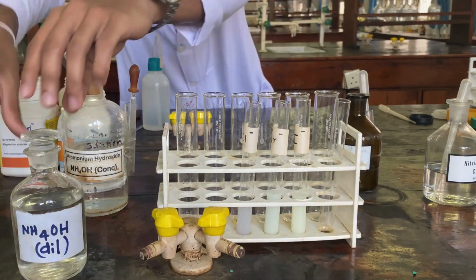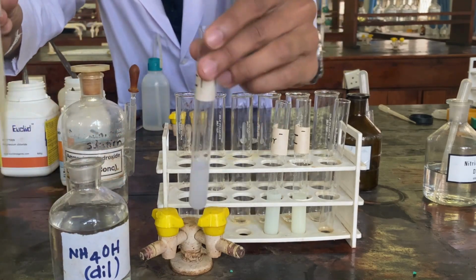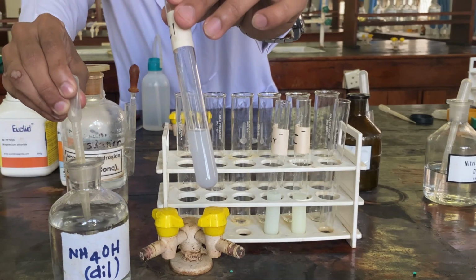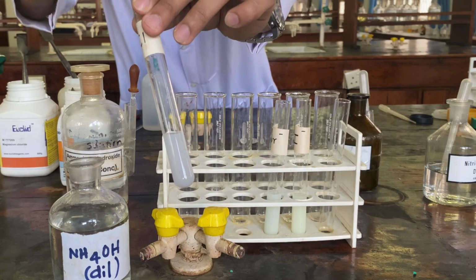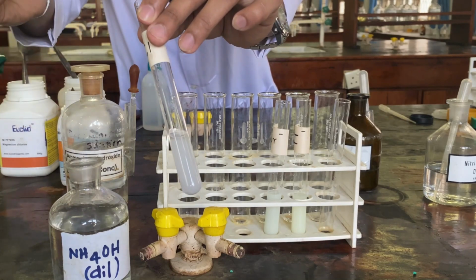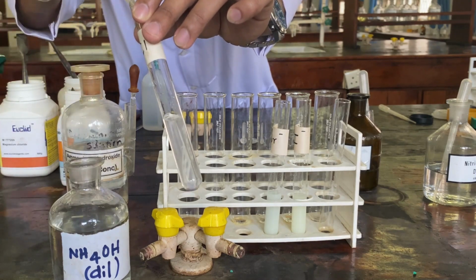Now, we are going to introduce ammonium hydroxide solution into each of these test tubes and check the solubility of the precipitates. First, we add diluted ammonium hydroxide to the first test tube which contains silver chloride precipitate and check the dissolvedness of the precipitate.